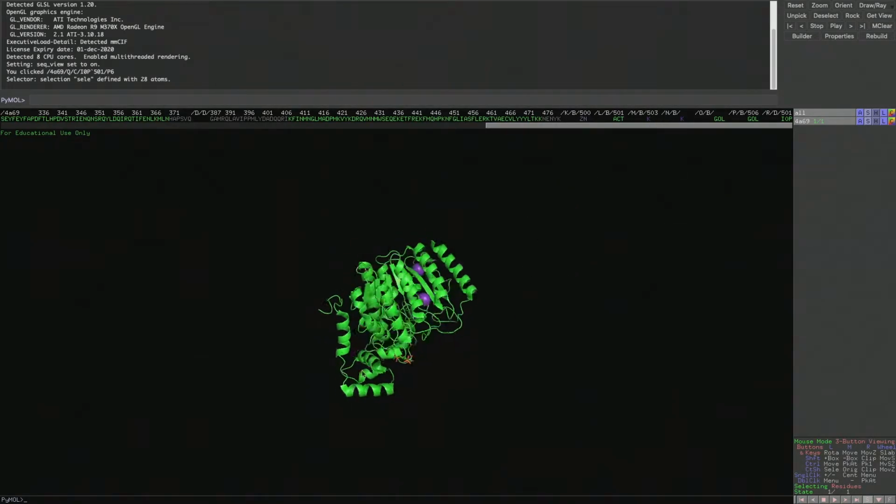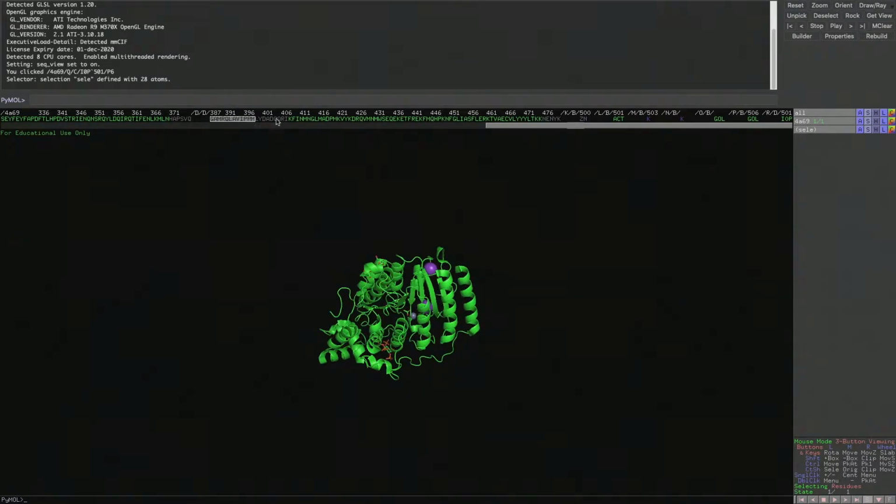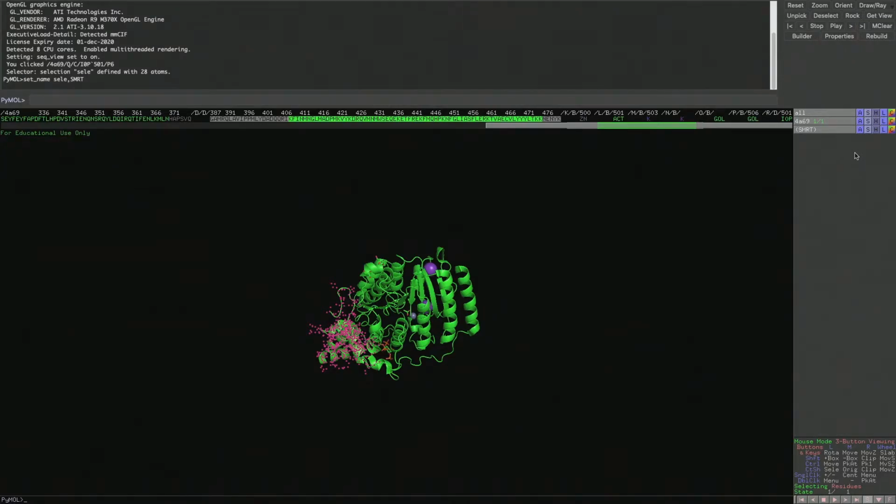So that's how I was using selection to remove part of the structure. Now, as I said before, this is actually 2 proteins, and you can indicate by the 2 chains. So I'm actually going to save this selection. So I'm going to go action, rename selection. And I'm going to call it Smart. Now, if I was to make a new selection, this thing would appear. If I want to get back to the Smart, I'll just click that, and now I've got that selection saved.